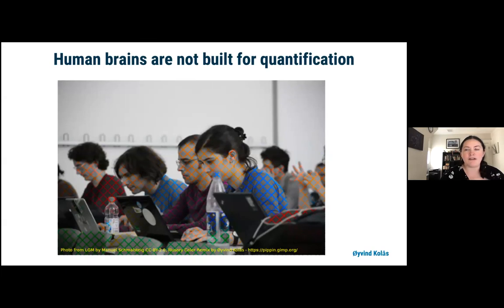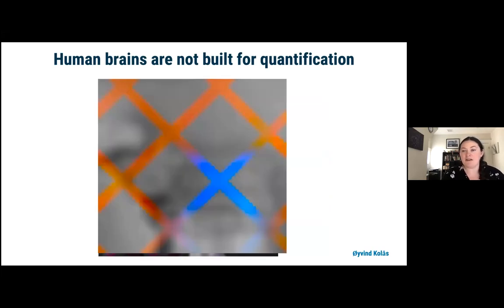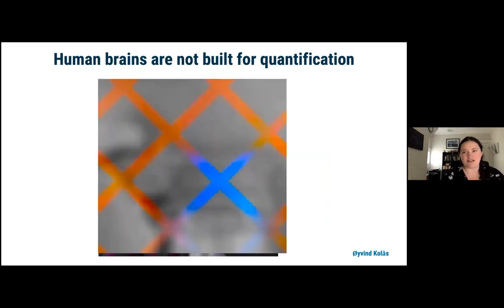Looking at this picture sort of quickly, or if you're looking at it on a small screen, this probably looks to you like a full color picture. It's not. This is a picture that is mostly grayscale with a few colored lines drawn on top. But your brain fills in the missing details and tries to give you an idea of the whole picture, the gestalt of what's going on. That's great from an evolutionary biology, understanding a situation quickly point of view, but it means that even if you think you can tell what's going on in your images by eye, your brain might not always be giving you the whole picture, or it might be giving you a picture that's more than the sum of the parts. And so automated quantification is something that we really think is important no matter what your phenotype is.